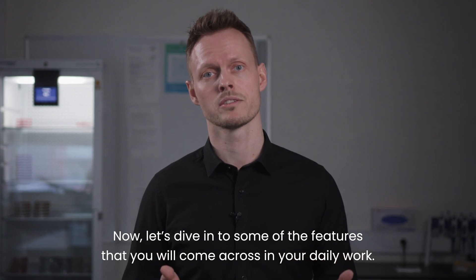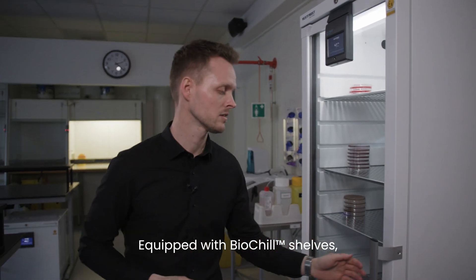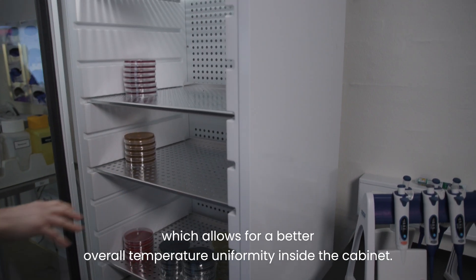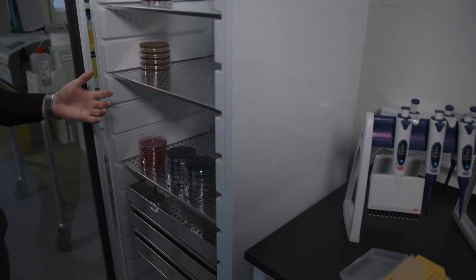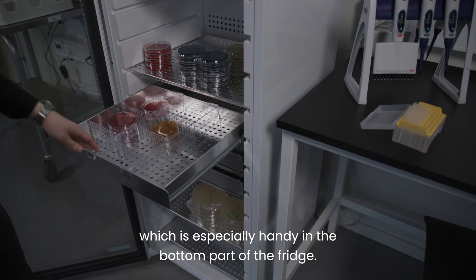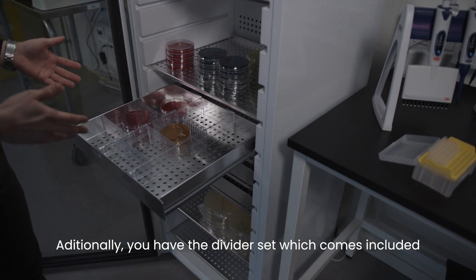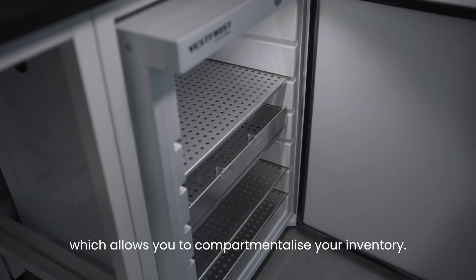Now let's dive into some of the features that you will come across in your daily work. Equipped with biotill shields, you have a flat aluminium surface for storage. The shelves are perforated for better airflow, which allows for better overall temperature uniformity inside the cabinet. Available as an option, you have the biotill drawer, which is especially handy in the bottom part of the fridge, offering some ergonomic advantages. Additionally, you have divider sets included, which allow you to compartmentalize your inventory.